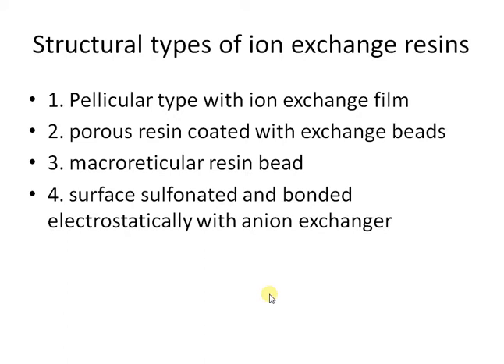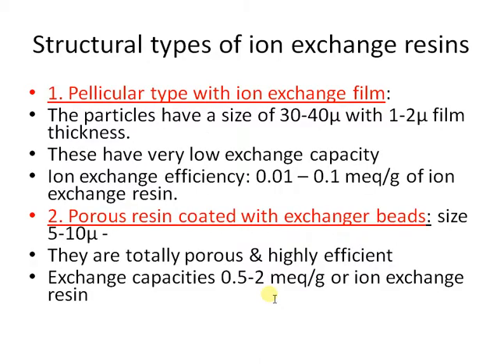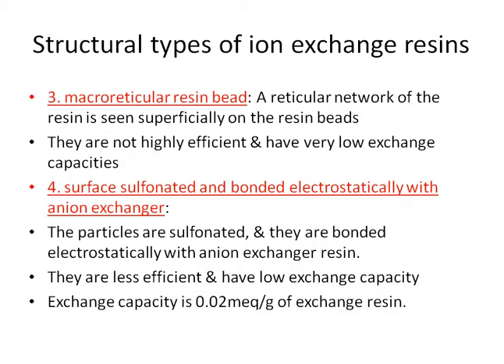Structural types of ion exchange resins: the pellicular type, a thin film of ion exchange on a core; porous resin coated with ion exchange beads; macroreticular resin beads; and surface sulfonated types, bonded electrostatically with anion exchangers.